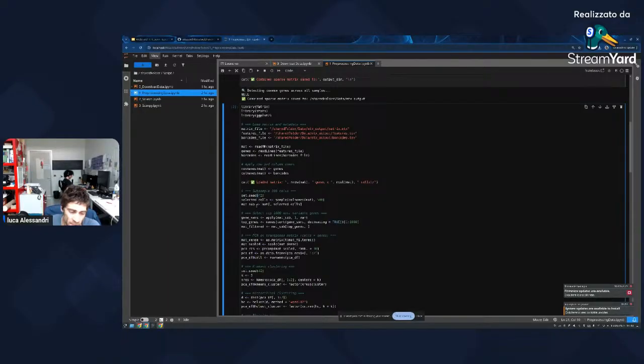The main thing is that randomness is a concept that a computer does not have. So it's using things in order to make it appear random, to have a random distribution, but it is not really random. So this value over here is important, because setting the seed means that you are setting the starting point of your randomness.